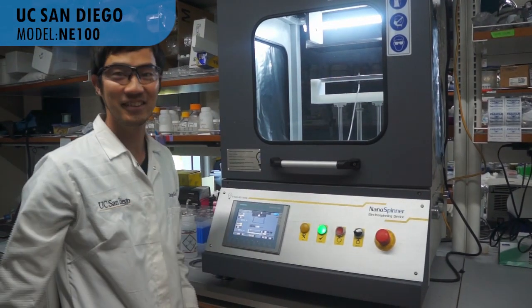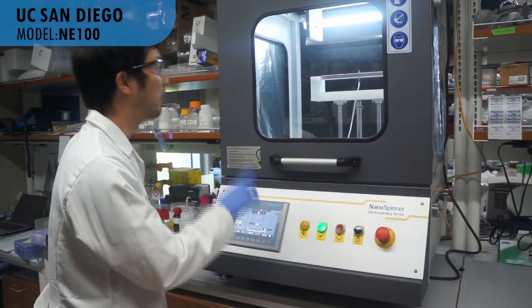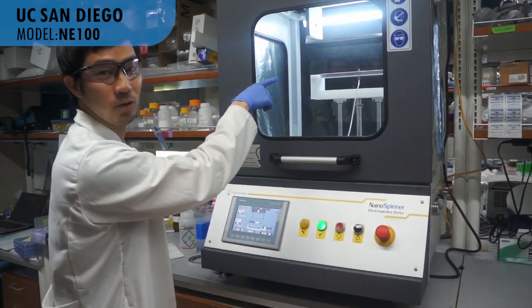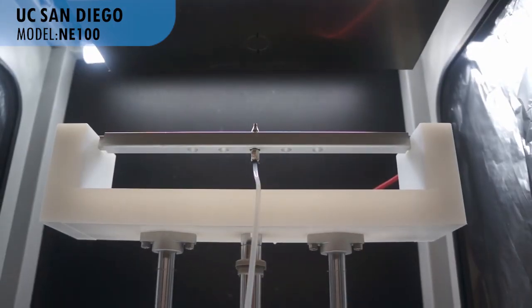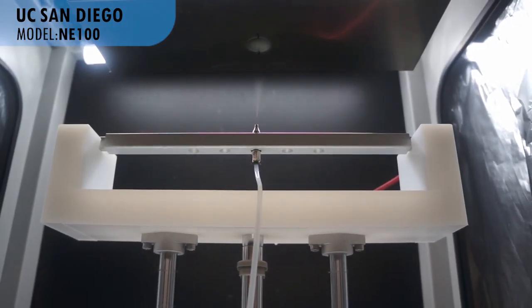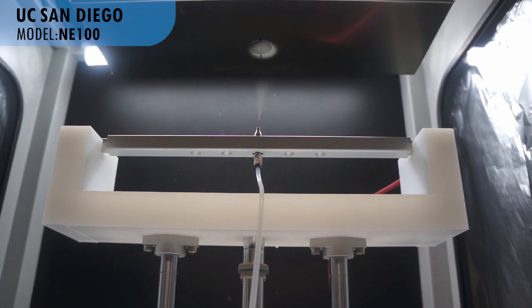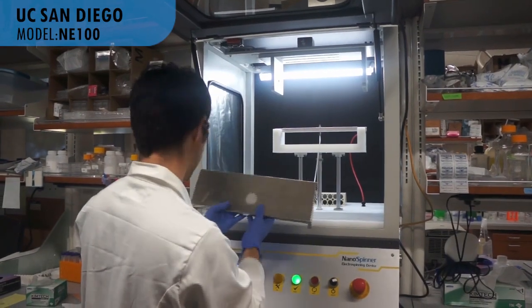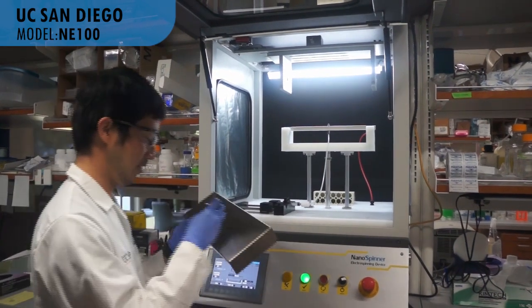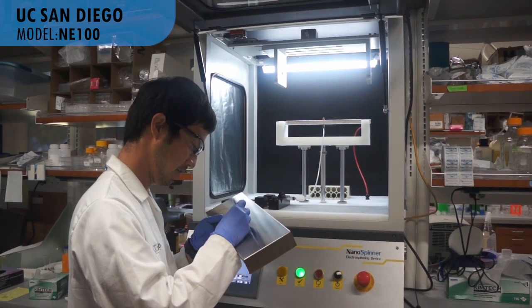And last, apply your favorite voltage between the tips of the needles and the plate. I've used this electric spinner to make fibers from polymer. And then you can collect easily what you want, like this.